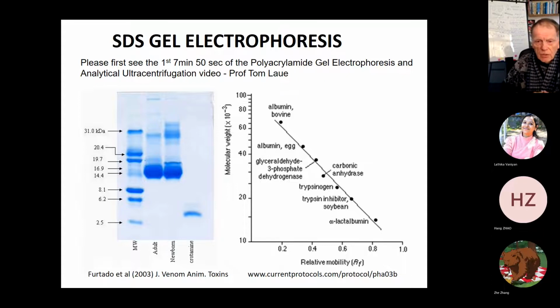You need to know one absolute method for molecular weight measurement in this course, which doesn't require calibration standards, and we've done that with osmotic pressure, which gives average molecular weight. Familiarity or the knowledge that there is this technique called sedimentation equilibrium in the ultracentrifuge, which can measure the average molecular weight, also an absolute molecular weight technique, not requiring standards.